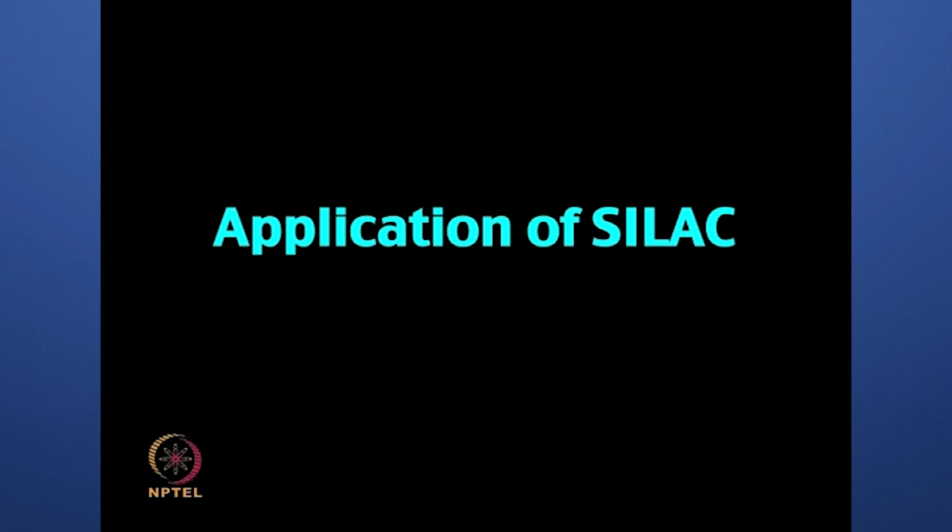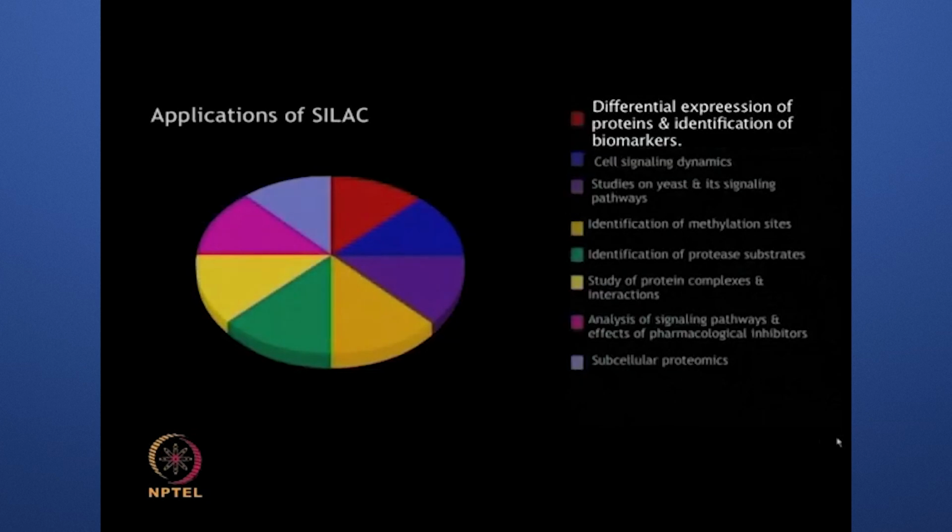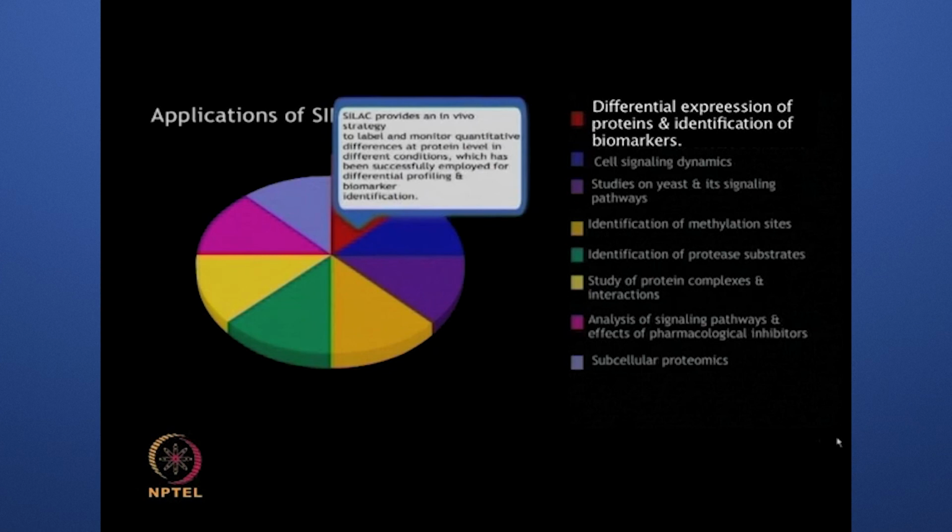Let us now discuss the applications of SILAC. SILAC is a very useful quantitative approach which has found application in several proteomic studies. SILAC provides an in vivo strategy to label and monitor quantitative differences at the protein level in various conditions, which has been successfully employed for differential profiling and biomarker identification.